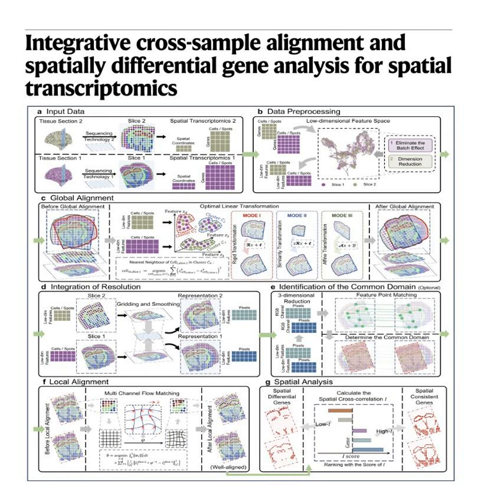And what did it find? It spotted that genes like CCL2, ACE, QKI, and HCLS1 were aggregating heavily right around the damaged arterial wall. Their spatial organization had completely reorganized in response to the disease to try and manage the local inflammation. Wow. There's a massive biological red flag that was completely invisible to the older volume-based tools.